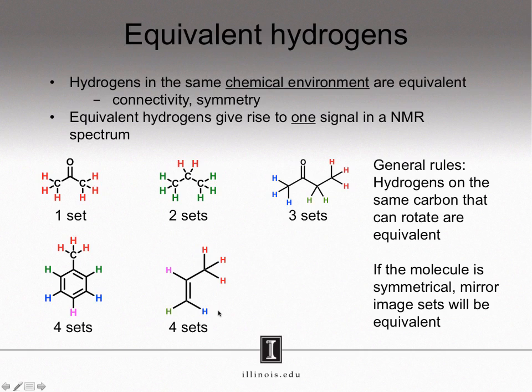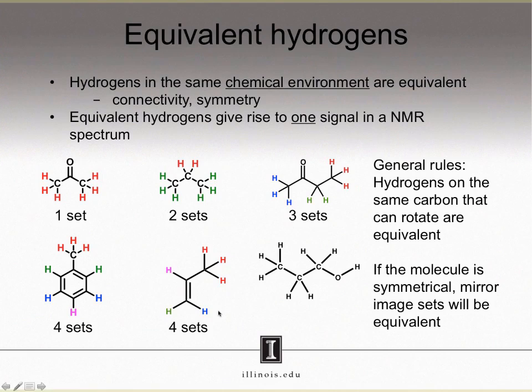Okay, let's give you some practice now. Here is 1-propanol. Pause the video, take a few minutes, and tell me how many sets of chemically equivalent protons are there in 1-propanol. Welcome back. Let's see how you did.